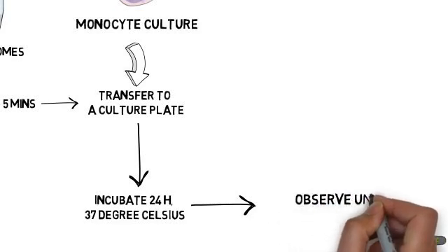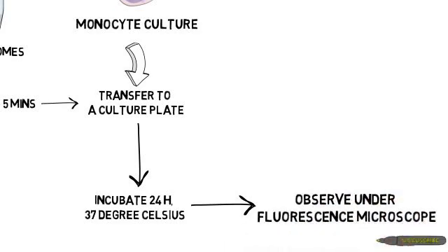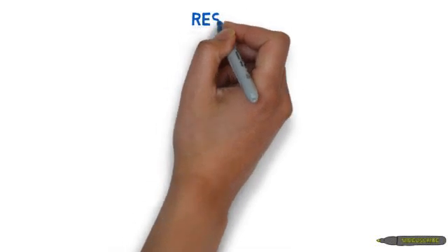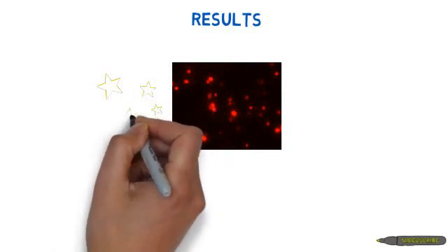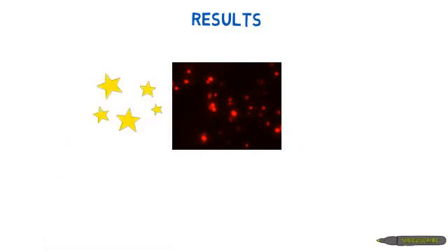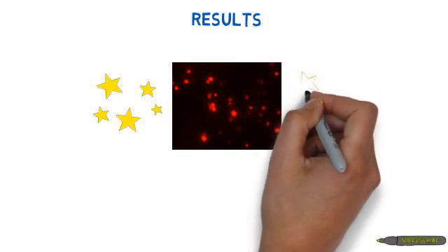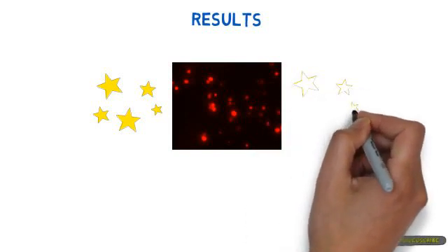After the incubation, I will observe the cells under a fluorescence microscope. Here we see that the transfection is successfully carried out, and the monocytes are glowing like Christmas tree lights. Amazing, isn't it?